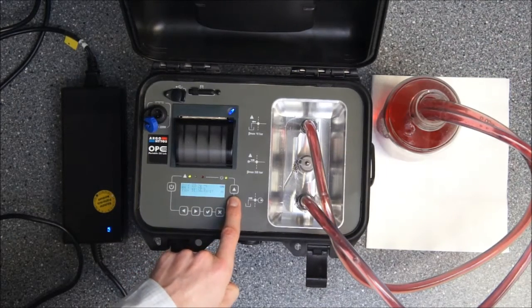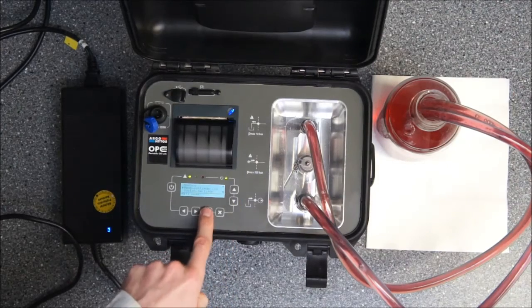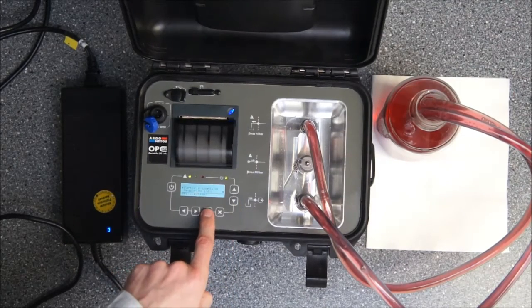For automatic mode we go into the menu by pushing one time the down button. Then you see we have the measurement settings and in the measurement settings there is the option for particle counting.